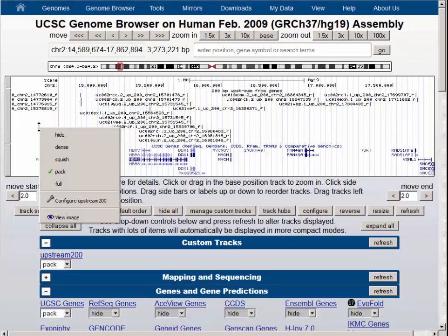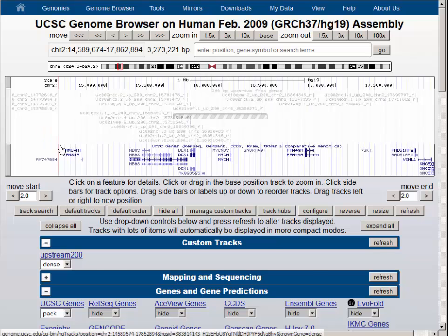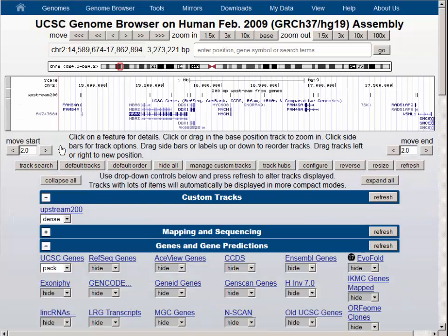We can see that we have each of the items near the upstream region of a gene. To get a closer look, let's condense the new track we just created using the right mouse button to dense visibility. We will zoom into the five prime region of the two genes we discussed earlier, NBAS and DDX1.